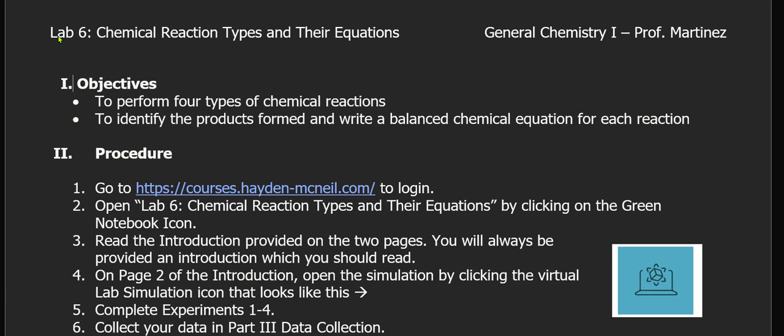Hello everyone. So in this video we will be discussing this week's lab, which is about chemical reactions and their equations. So you will be performing 4 types of chemical reactions, and then you will identify the products and balance an equation. You will write the entire balanced chemical equation.